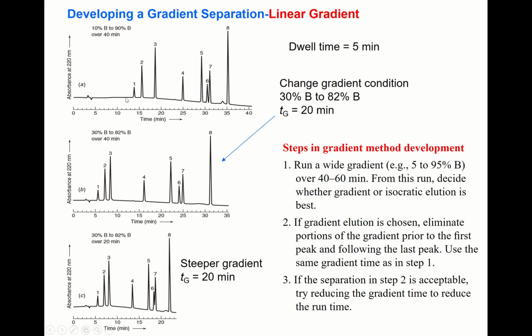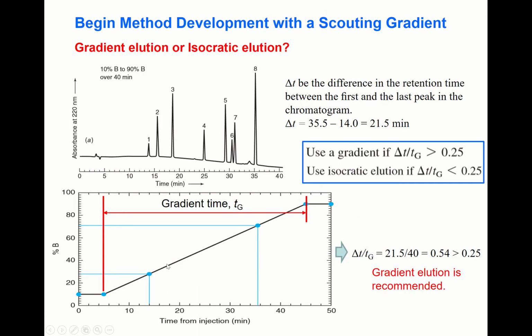Peak one appears at maybe 14 minutes, so up to 14 minutes we can reduce this time quite a bit. How?